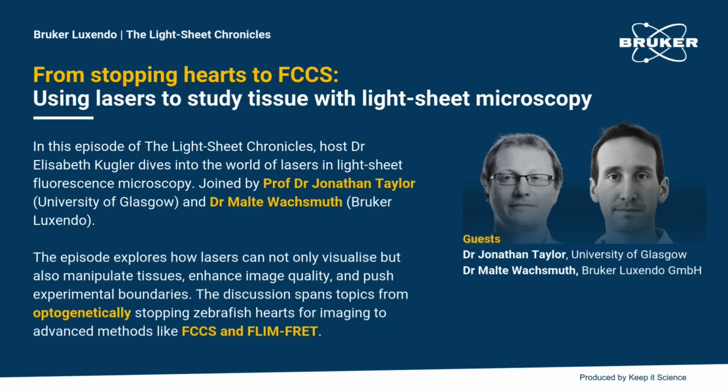One way to overcome this would be to dynamically scan the beam waist axially back and forth. This can be done, for example, by introducing a tunable lens.